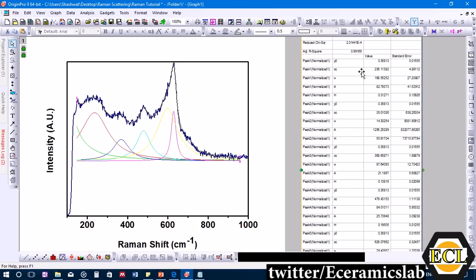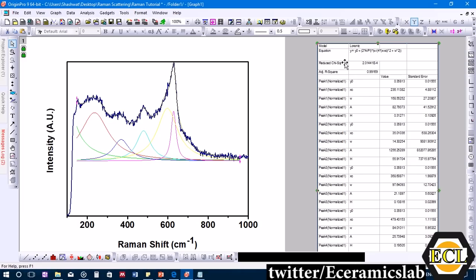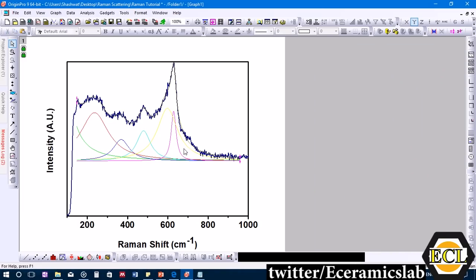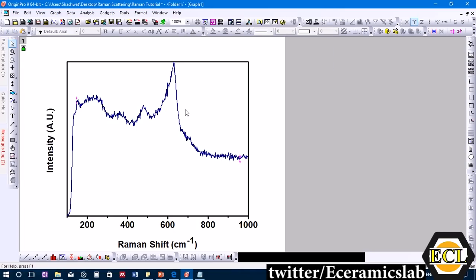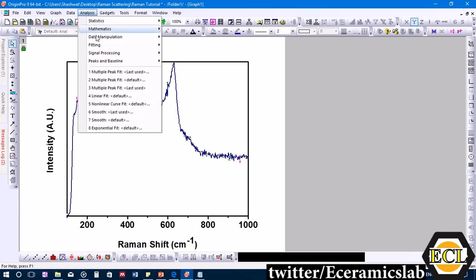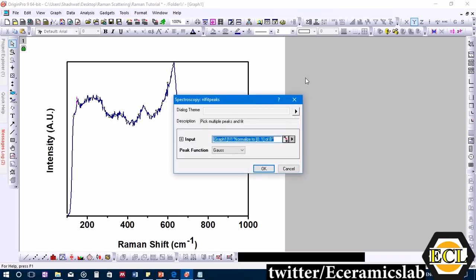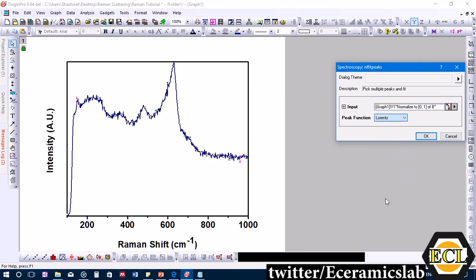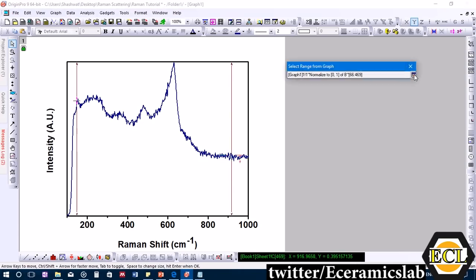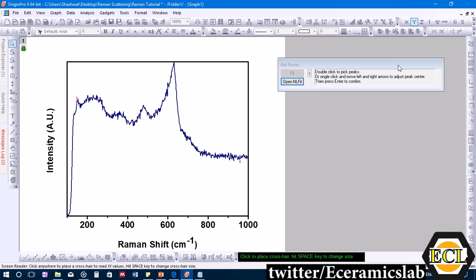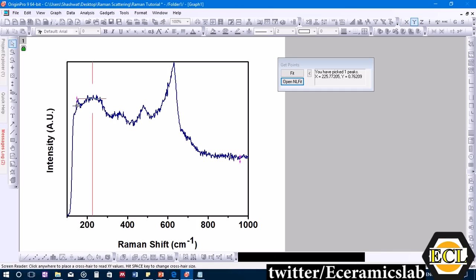However, for peak 2 the value is 35.01, which doesn't correspond to any visible peak position on the horizontal axis — so this is wrong. We need to go back, remove that extra peak selection, and redo the fitting with corrected peak positions. We go back to Analysis → Peak and Baseline → Multiple Peak Fit → Open Dialogue, select Lorentzian again.